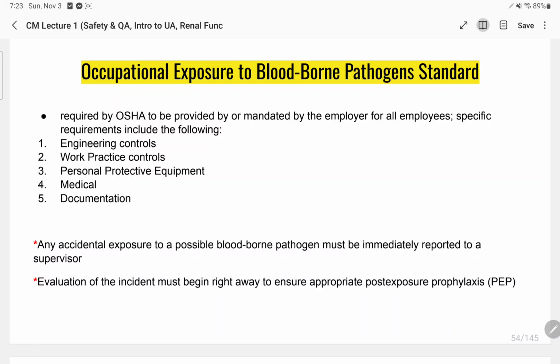For example, you got pricked, and the sample was hepatitis B positive or worse, HIV positive. Although the percentage of transmission via the cutaneous route is small, there is still a percentage. So what if you fall within that small percent? We cannot gamble or risk that chance. It is better to be sure than to regret it later. If you break something or get exposed, tell your supervisor.